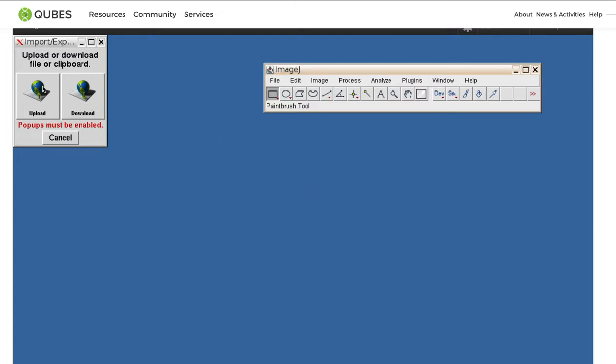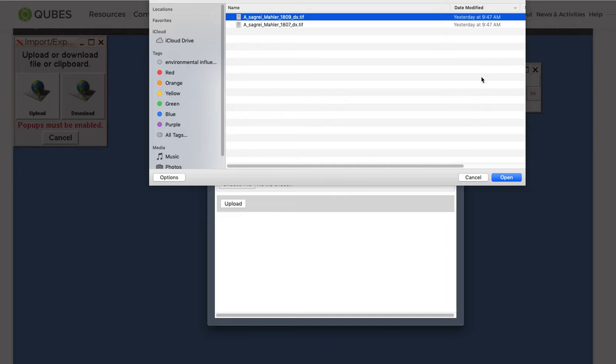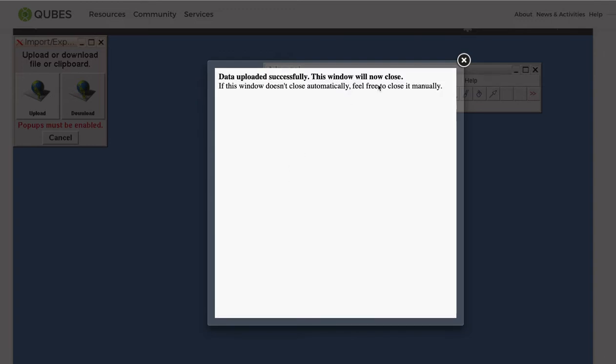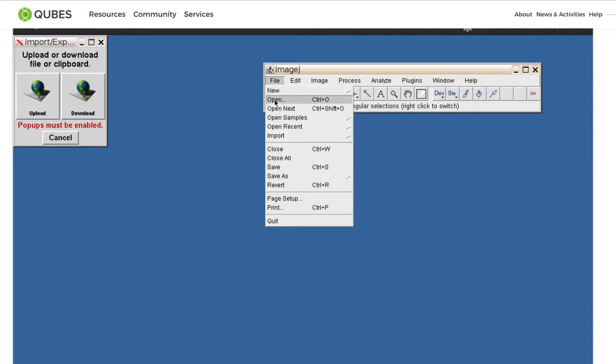Okay, I'm going to go over how to set the scale bar measurement for the assignment 1 on the Anolis lizard. So the first thing I'm going to do is upload one of the files that I will have downloaded from D2L, and I would go here, we'll do this one, and upload. And it may take a minute, but it will work. Once I've uploaded my file successfully, I will go to open that file.